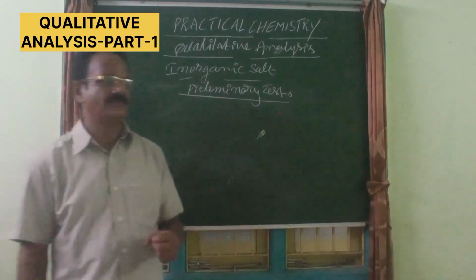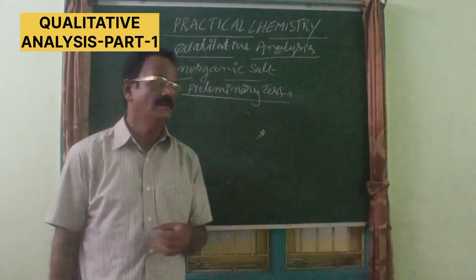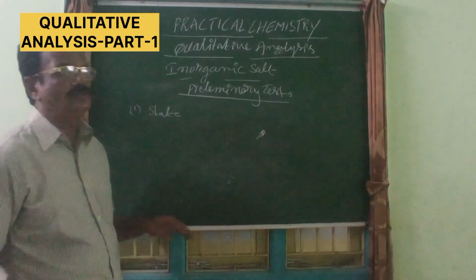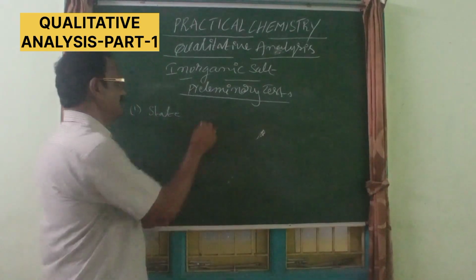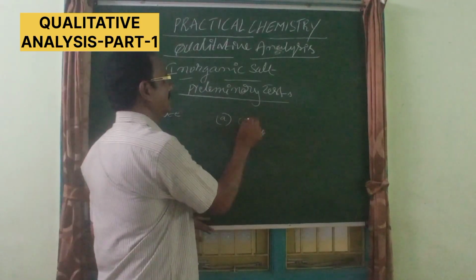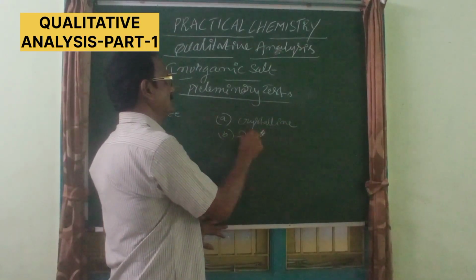See what information one can get by doing preliminary tests regarding inorganic salt. Let us consider the first preliminary test, the state. Here two observations can usually be made. A, the given inorganic salt may be crystalline or amorphous.